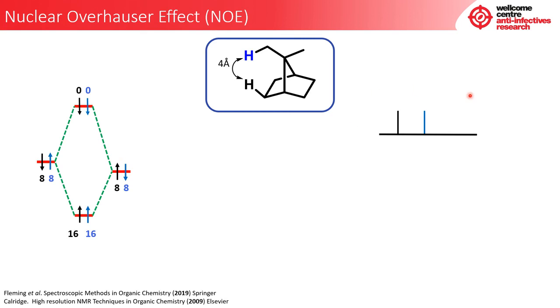Now, what is it that we want to measure or look at? So, let's start to look at the spectra, because we're not actually going to be drawing this out when we're using the NMR. We're going to be interested in something that looks like this. The first of the transitions that we would like to measure is what is known as the double quantum transition. And what do we mean by this? Well, it refers to the movement between the beta-beta, or the high energy system, all the way to the low energy system, otherwise known as alpha-alpha. It is called double quantum because with the source spin, in black, and the interesting spin, in blue, it takes both of the nuclei with it to make it go upfield.